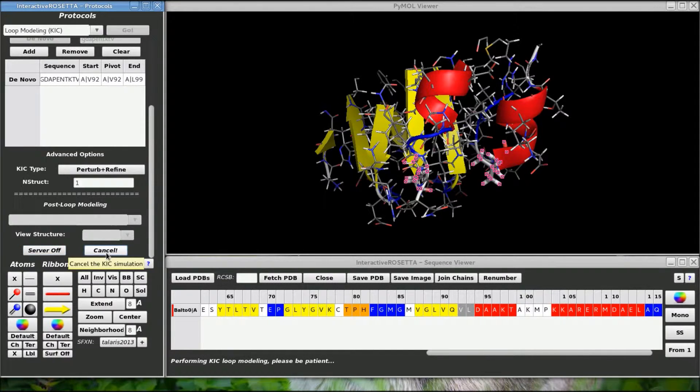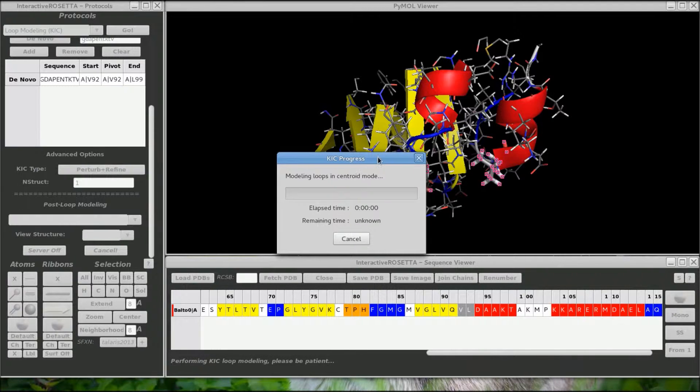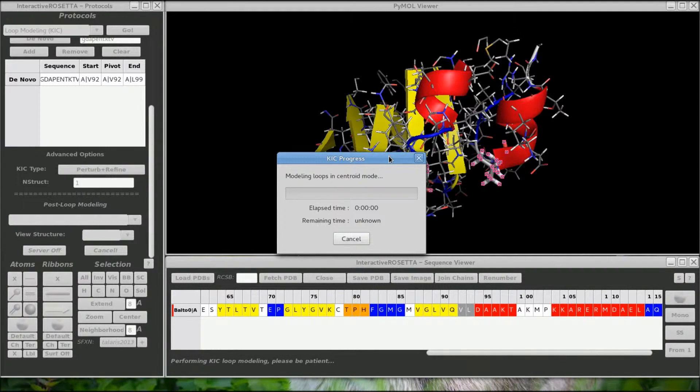When you are ready, click on the kick button. You will end up getting this fancy progress bar to show you how far along in the simulation you are.